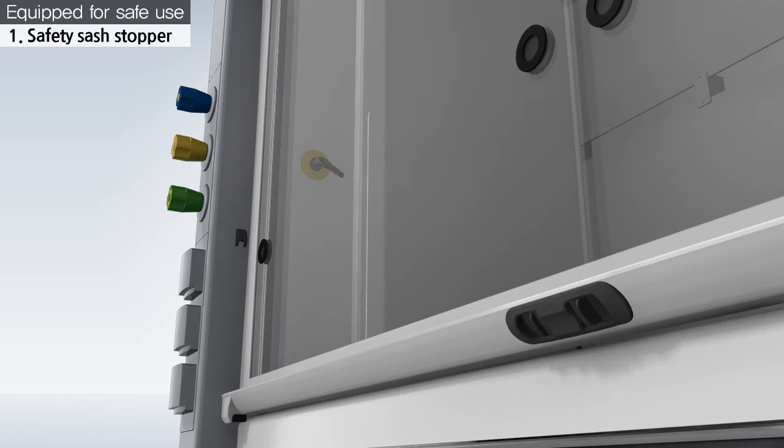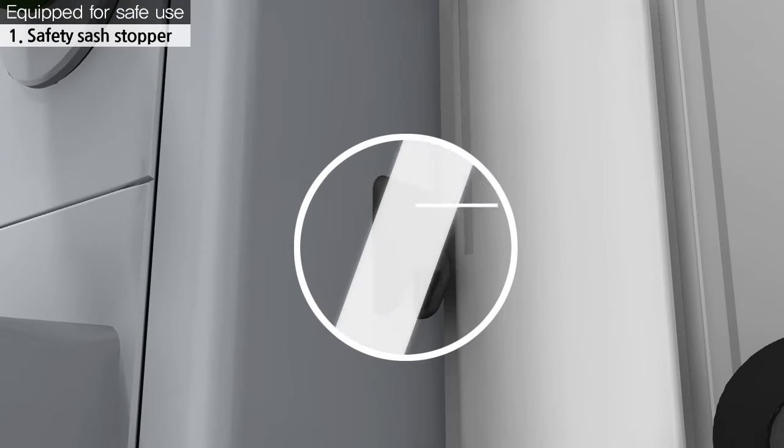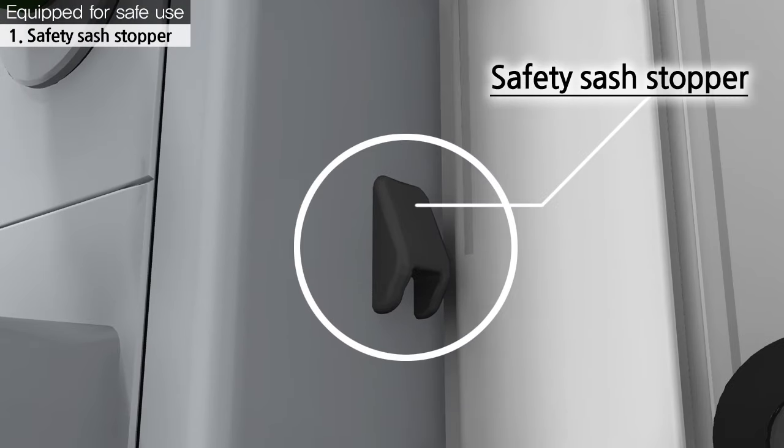In the case of a vertical sash, a safety sash stopper is installed with a height of 500 millimeters, so it would not exceed the required level during experiments.